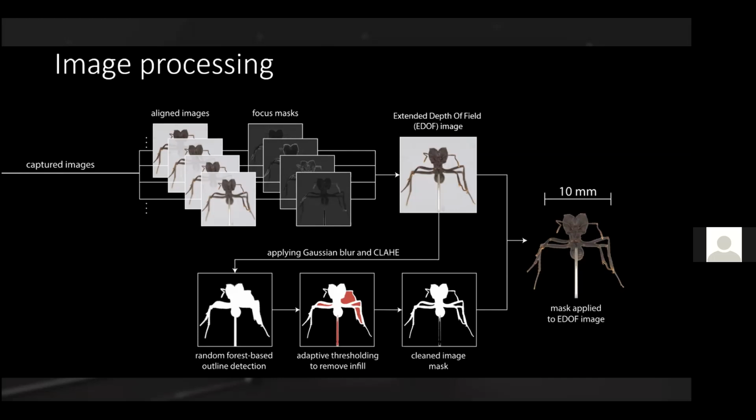You can do this at any point after the actual physical scanning or physical taking of pictures, or you can do it while you take it, which saves time, but requires a minimum amount of computational power.